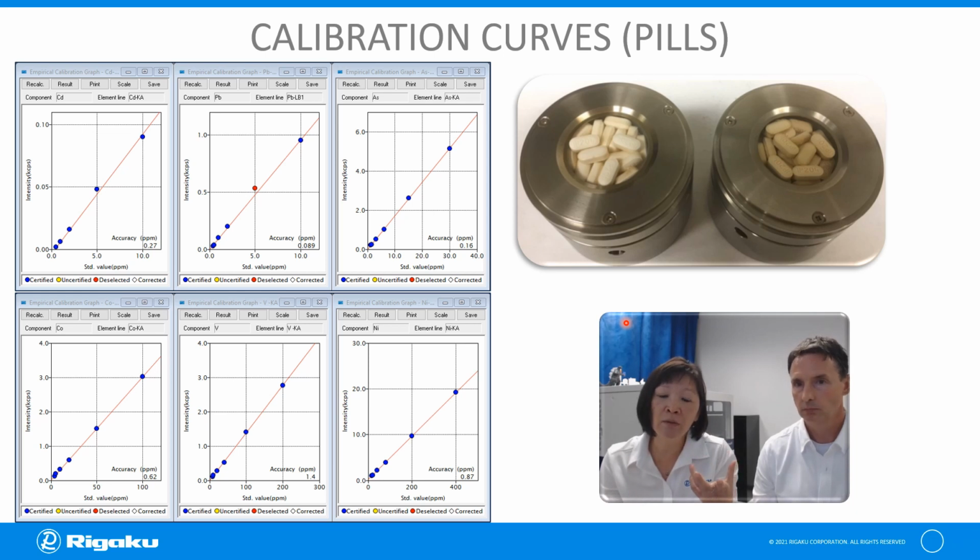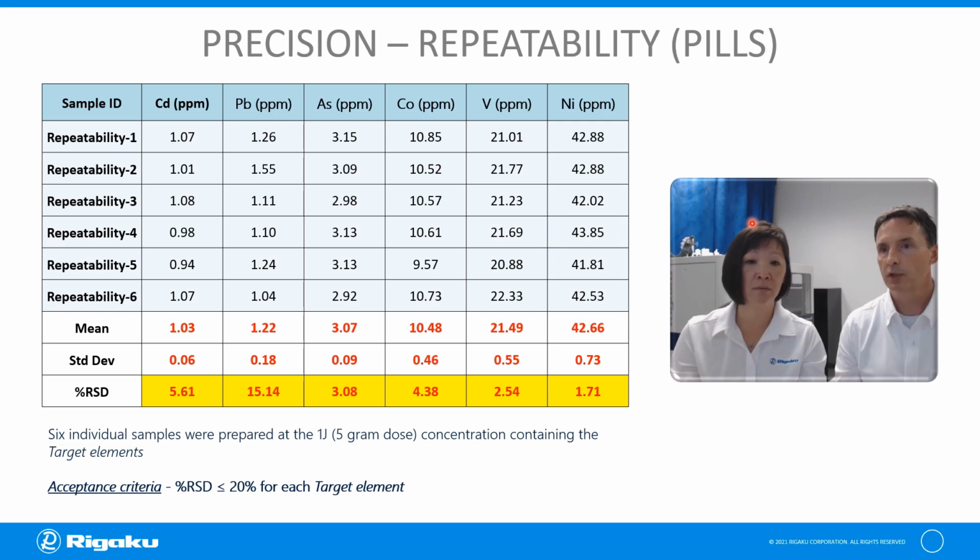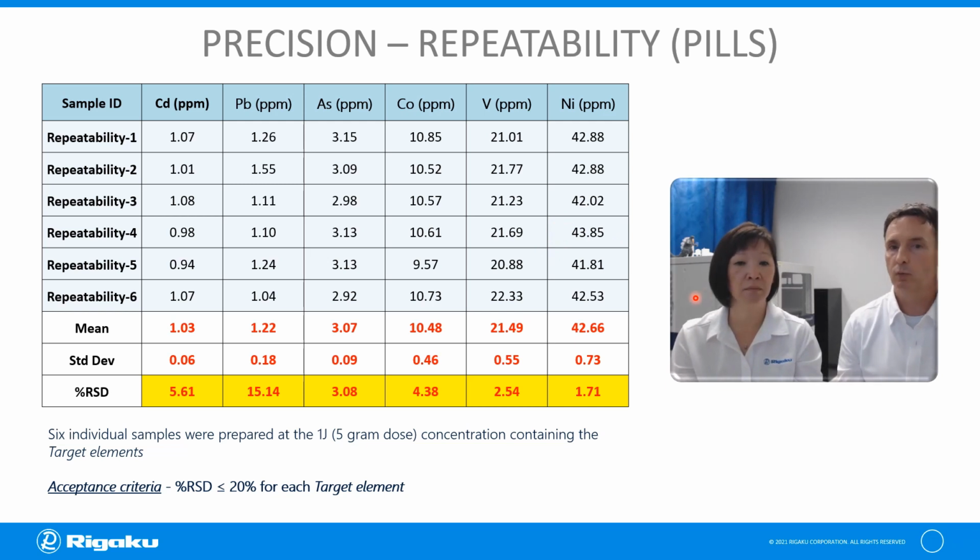But then what if we have different size pills that are oblong, different shape? How will that affect our results? And what about orientation? How you put them in? Is there a particular way we need to, or can we just pour it in and analyze them as is? So this was just looking at as we had prepped, the same dimensions, the same pill shape, etc.